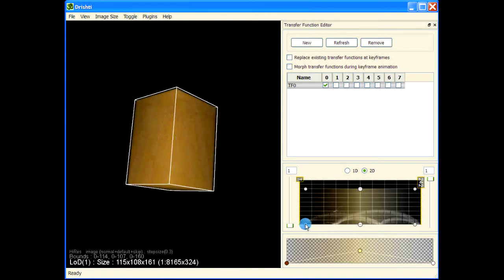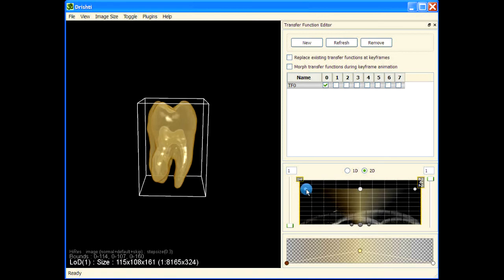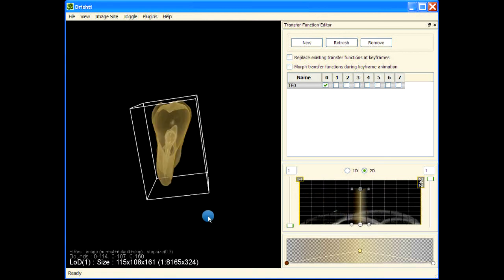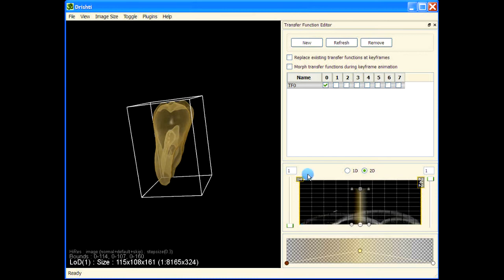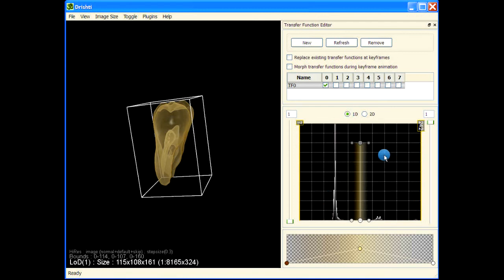Using shift and left mouse button I'm changing the size of this spine here, and then another one here. The histogram we see here is called the 2D histogram, and this is what is called the 1D histogram.